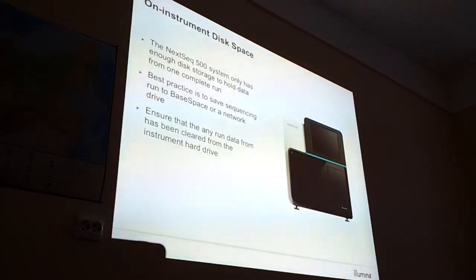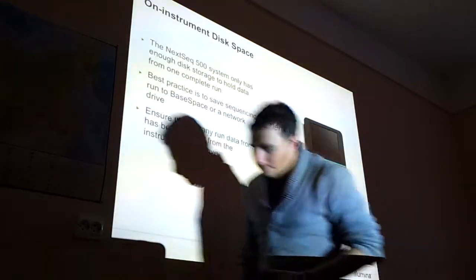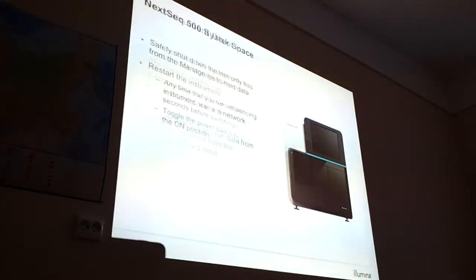Yes, I said this already. The storage space on the disk is only good for a maximum of one run. So never leave old data on the disk. And ideally, as network location, always choose a different computer.